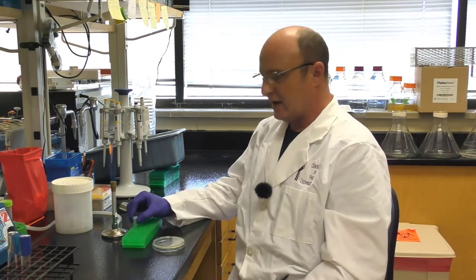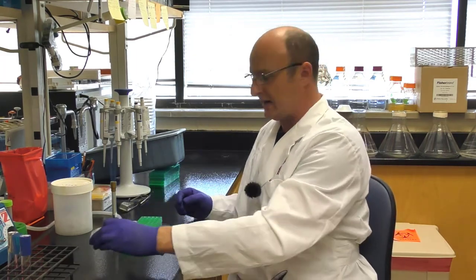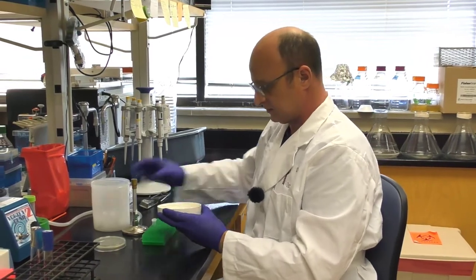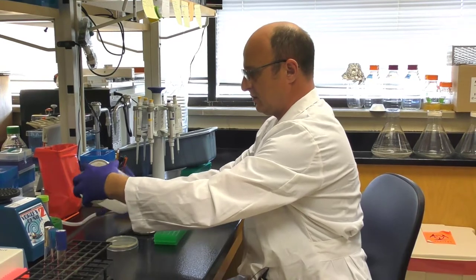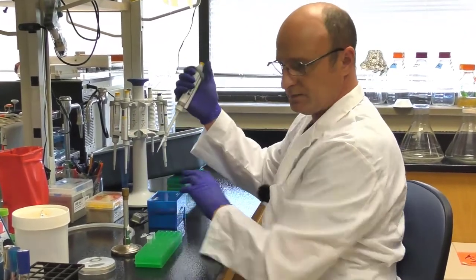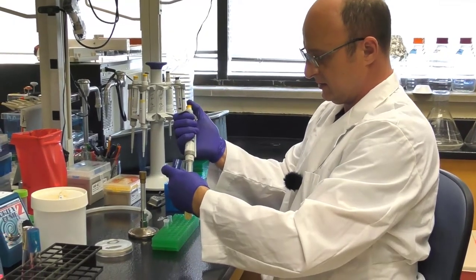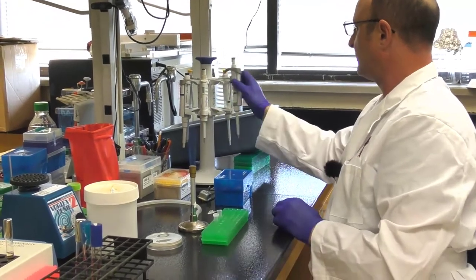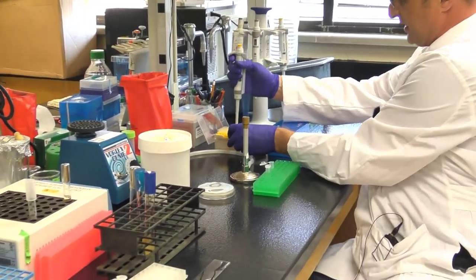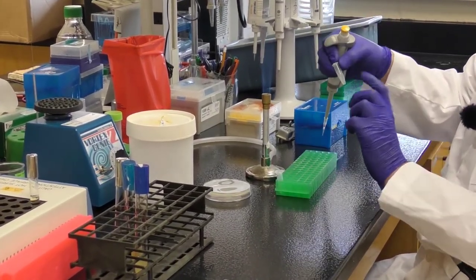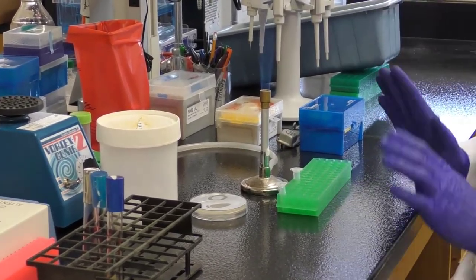Okay, so now we know the volume of lysate that we need to make our HTL plates. We have our phages, our phage lysate. We have our labeled plate. I will take a tube and much like whole-plate titers, we're going to pre-incubate phages with the host cells. I will take a 100 microliter aliquot of my host cells, add that to the tube, and then I will take the calculated volume of phage lysate and add that to the cells. We'll give that a little mix. And just like with the whole-plate titers, we'll let that incubate together for five minutes.